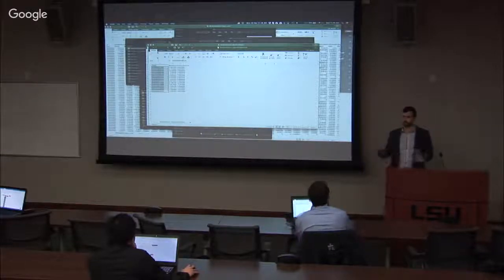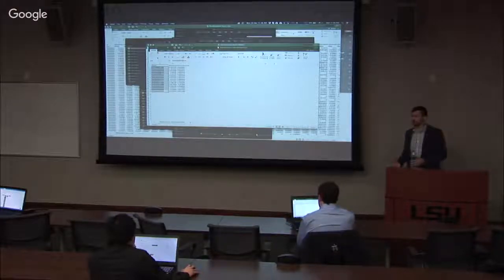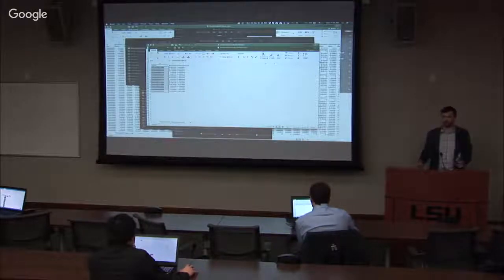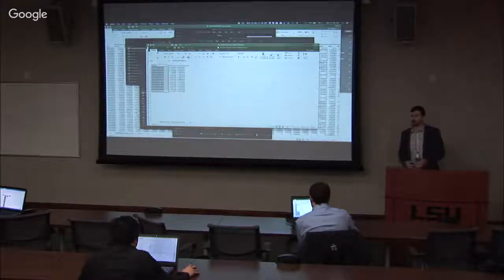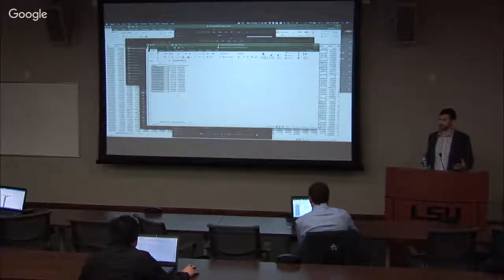I have tens of thousands of genes to start from, and I want to go to some pathway annotation, and each pathway has maybe 50 to 100 genes in it. What am I going to do with 15 genes? It's not going to be enough for me to accurately identify some pathway or some biological process. So I want to enrich this list.